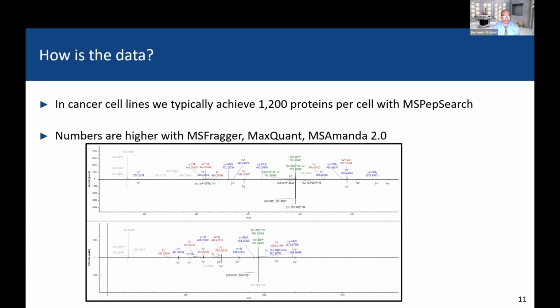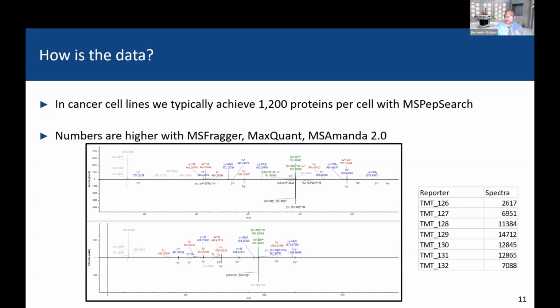It looks really good. And again, I really like spectral libraries, and these are 2 peptides I care a lot about because I'm doing a lot of work with KRAS, and it's a kind of terrible protein to work with, with all these little isoforms and all these things. But on the bottom here, you can see my mirror plots of my spectral libraries versus my real data, and you can see this little offset in the reporter region because I'm using one of the C tags that I don't actually use for my reporter ions. And I do offline fractionation, collect the data, and I use that to build my libraries.